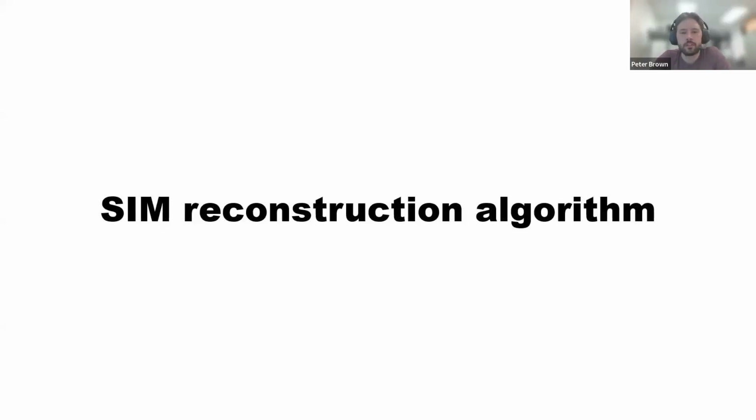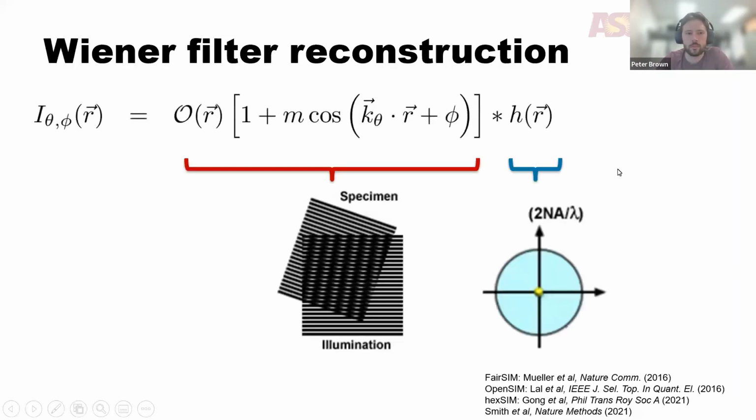Now that we've discussed how to generate and assess high quality SIM data, we're going to discuss the SIM reconstruction algorithm. At the outset, I should say there are many different ways to reconstruct SIM data. We'll discuss the classic Gustafsson, Heintzmann style Wiener filter reconstruction algorithm.